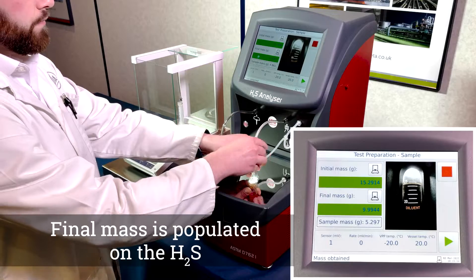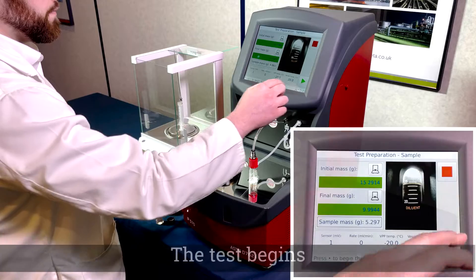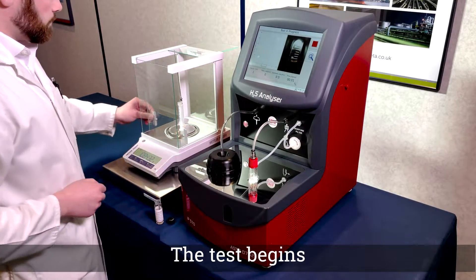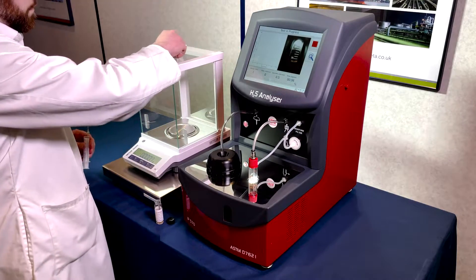Ensure the test vessel cap is tightly secured and press the green play button to start the test. For the first three minutes, the instrument self-purges with air and checks flow rates. At this point, no air bubbles can be seen in the test vessel.